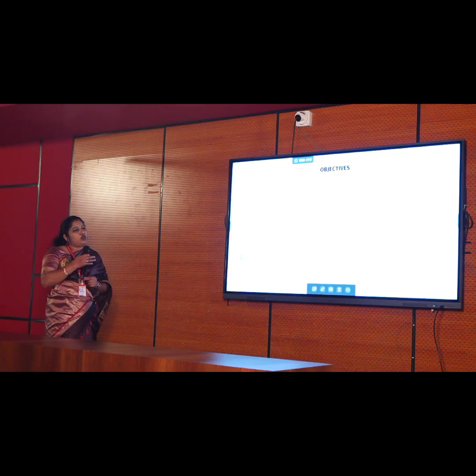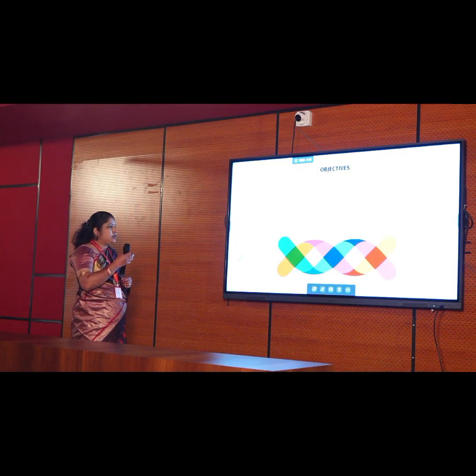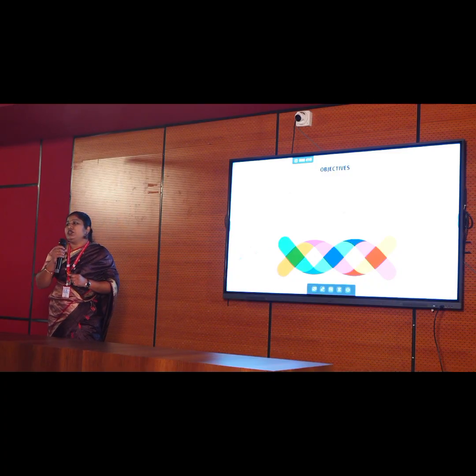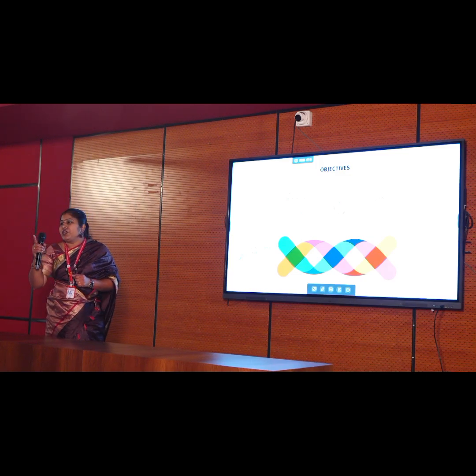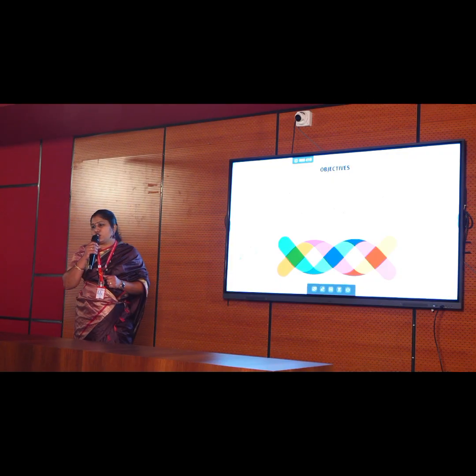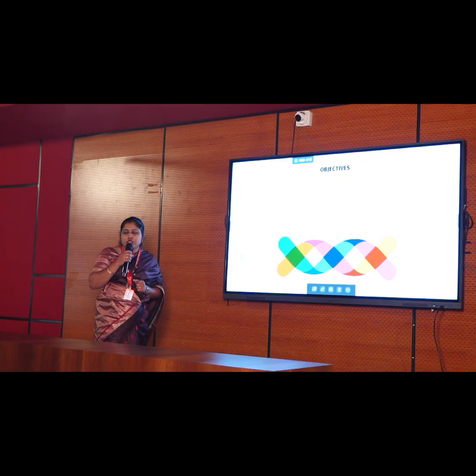So, the objectives we are focused on: first, we are going to demonstrate the DNA which is present. As we know, DNA is present in all living cells, so we are going to demonstrate to the students that DNA is not only present in one sample, but we can extract it from various samples. For that we have taken different plant sources, which I will deal with in the next slides. The objective is practical exposure for the students. Then scientific skills like observation and analysis were developed through this experiment.